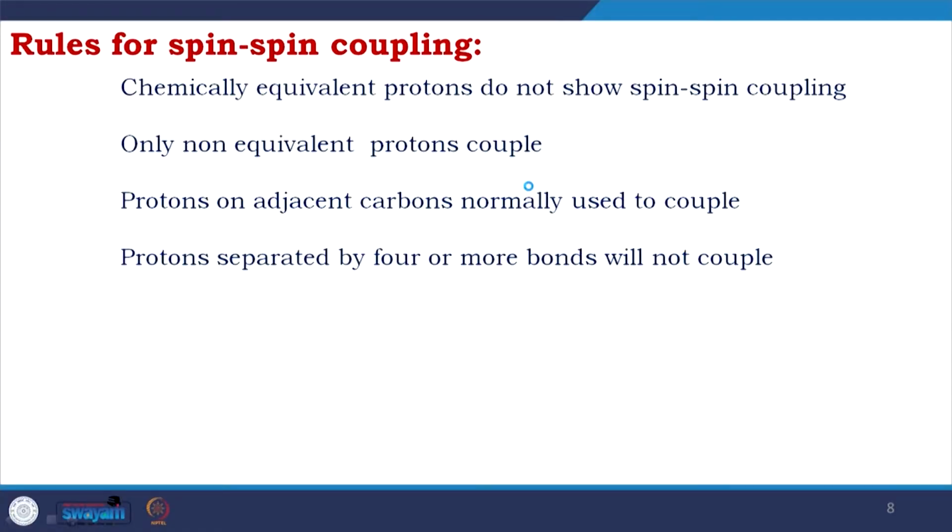Protons separated by 4 or more bonds will not couple. This is space, so the distance when it is around 4 bonds, it is not going to couple, or better, they are not going to show the effect.